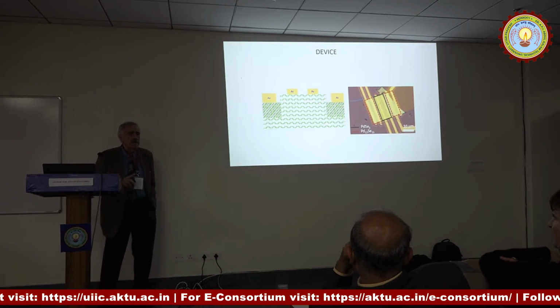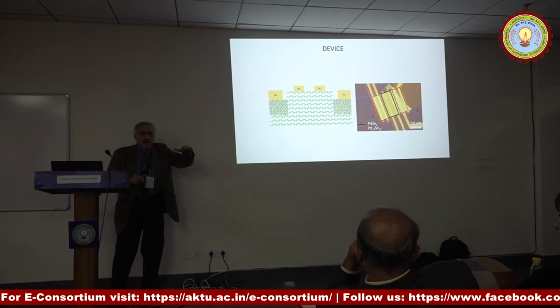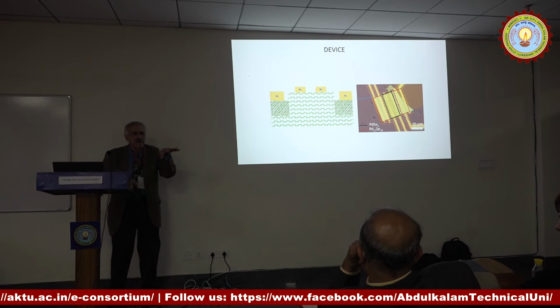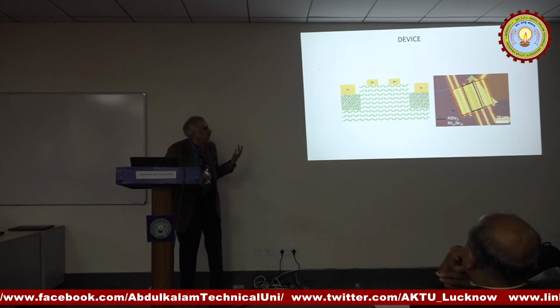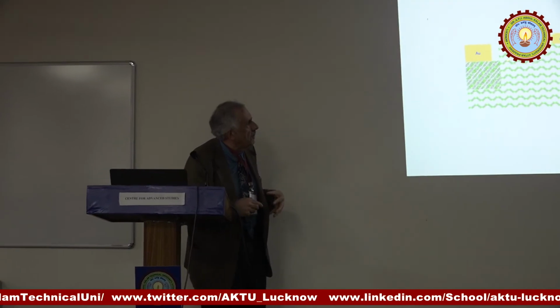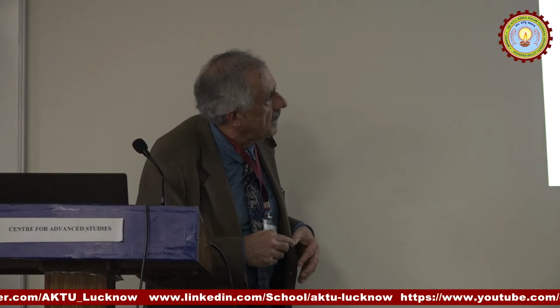The purpose of this was to make a device by making good contacts. Contacts to two-dimensional materials have always been a problem because the two-dimensional materials are layered. They don't like to interact with anything. They don't interact among themselves as layers, and to put a metal, a gold contact, on it doesn't stick very well. But by doing this process with the ion bombardment, you start with the layered material, you put a mask on it, then you do the argon plasma there and there, and you get this incorporated in the structure with an excellent contact.